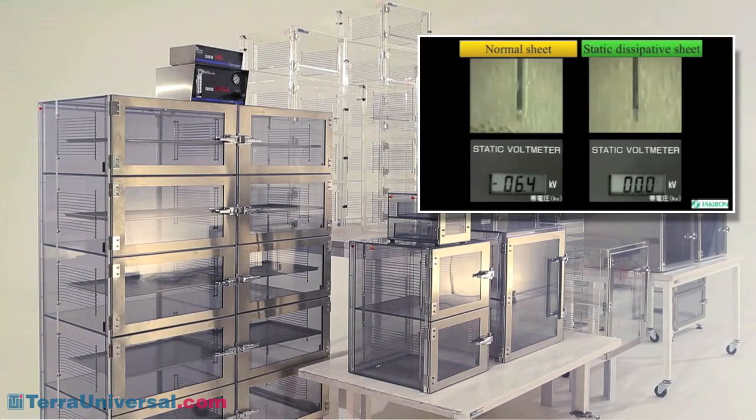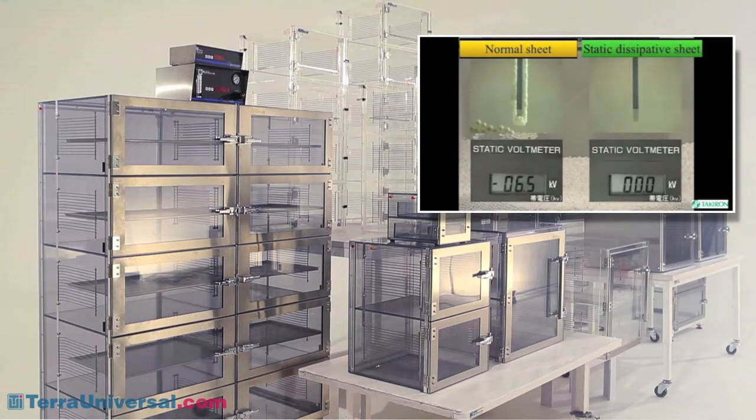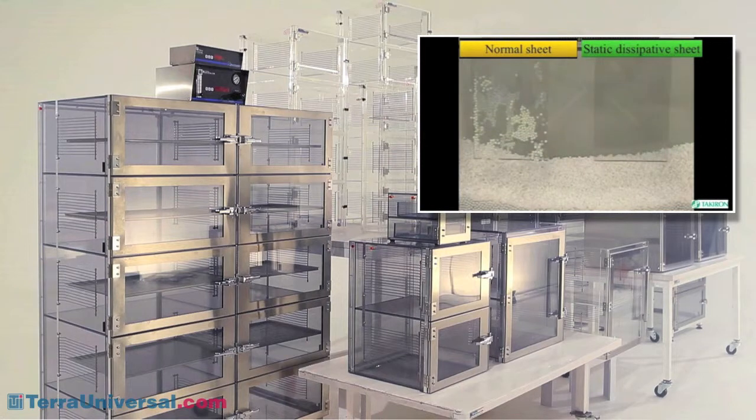Static dissipative PVC cabinets prevent these problems, making them the models of choice when you're concerned about a clean, sterile, static-safe environment.